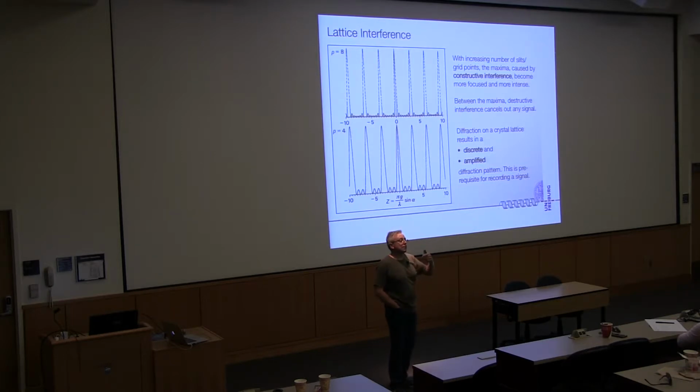but that is also what introduces the averaging. Like single particle analysis, at this point, we only get constructive interferences from those parts of a molecule in a unit cell that look the same in every unit cell. Okay, so we average over all the unit cells. I can tell you I can draw you every atom in that crystal. Yes, that's true, but what I draw you in truth is only a copy of the image that we get for the asymmetric unit, because that is actually an average of the entire crystal.